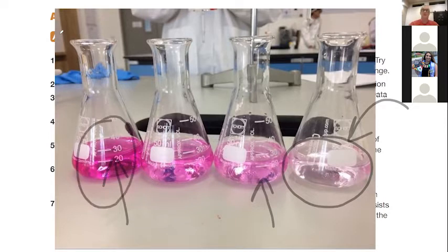will not give you a good result. This will give you an excellent result. This one will give you a pretty good result, but that last one will give you a crappy result. And that's why we want you to take the picture, because basically it'll show us how careful you were doing the titration, and that will affect your grade.